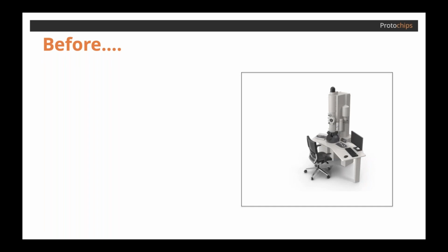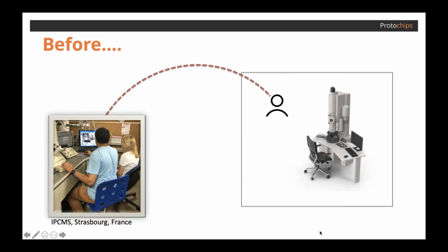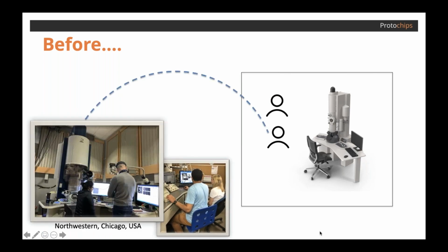While this slide is really not news to anybody, it really does set the stage a little bit for what we're going to talk about. We know research is inherently a very collaborative activity, gathering people together with different areas of expertise in hopes of discovering a novelty or finding a breakthrough that fosters improvement. Whether the expertise is in equipment operation, a scientific application, or data analysis, each person in this research effort plays such an important role due to the depth of their knowledge in those specific areas.